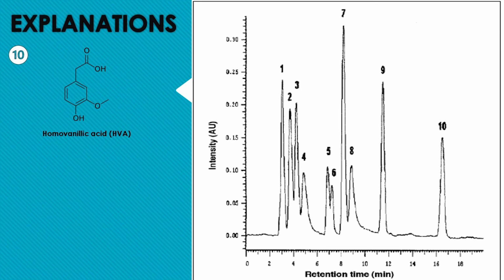These results may be affected by the stability of the amino compounds, which is influenced by certain factors like pH and concentration of the mobile phase, which is methanol. The presence of light and air is very crucial to the stability of indoles, and that may explain why the compound seems to have different polarity.